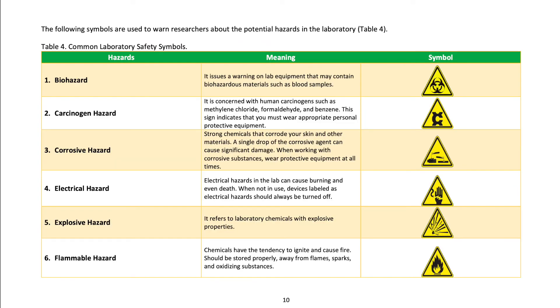Laboratory hazard symbols — the following symbols are used to warn researchers about potential hazards in the laboratory. Biohazard: issues a warning on lab equipment that may contain biohazardous materials such as blood samples. Carcinogen hazard: concerned with human carcinogens such as methylene chloride, formaldehyde, and benzene; this sign indicates that you must wear appropriate personal protective equipment.